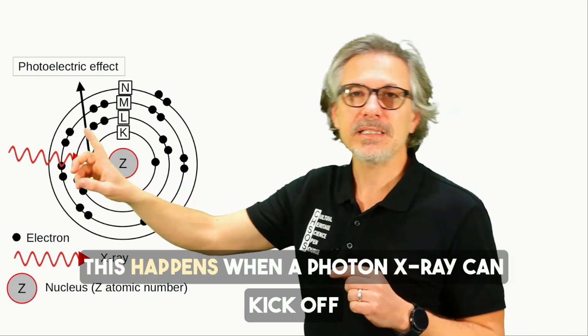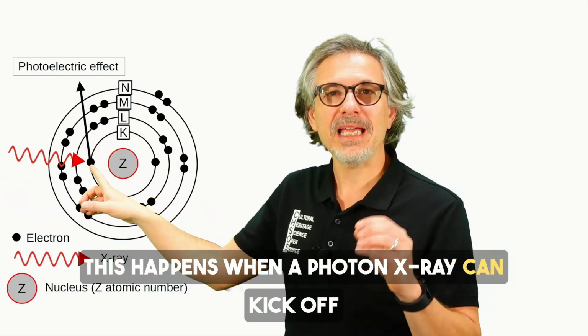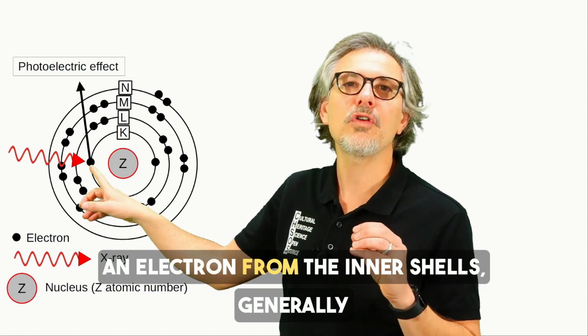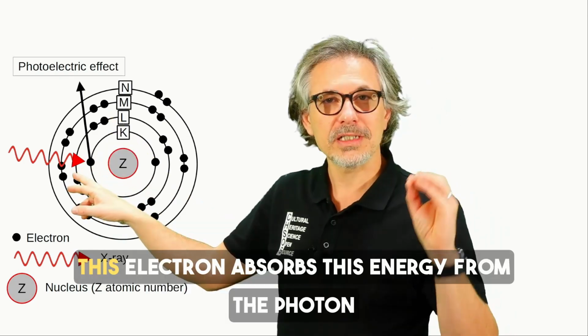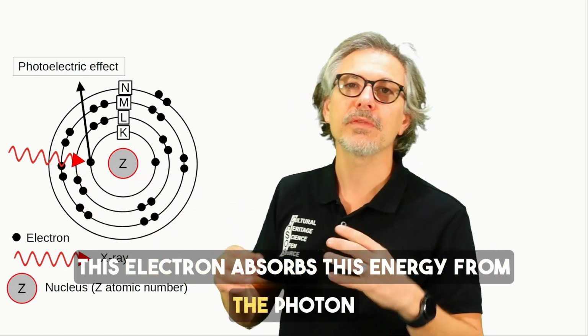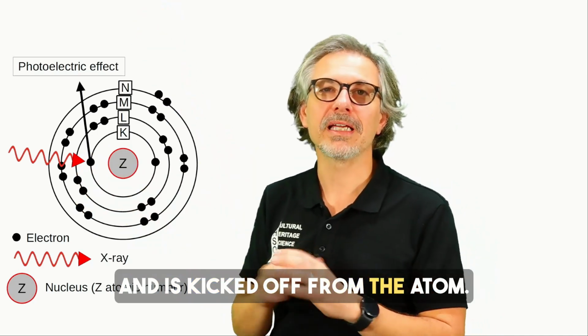This happens when a photon, particularly an X-ray, kicks off an electron from the inner shells, generally the K, then the L and the M. This electron absorbs the energy from the photon and is kicked off from the atom.